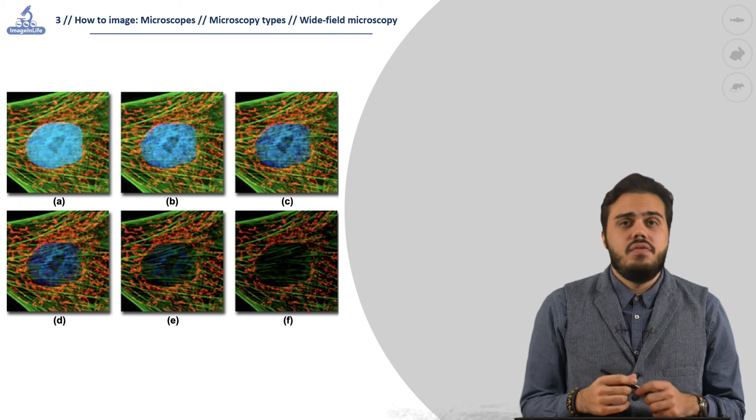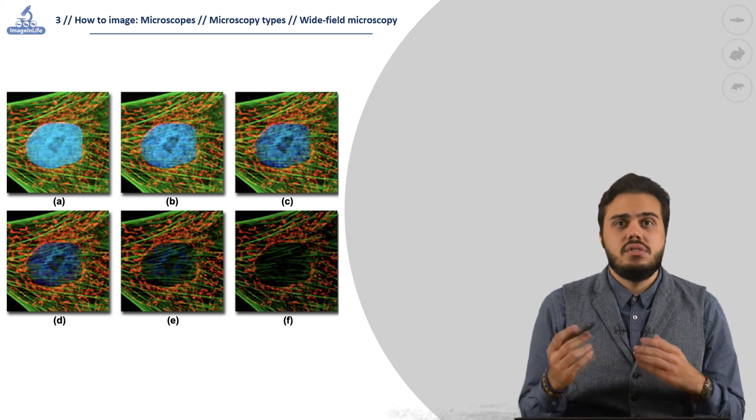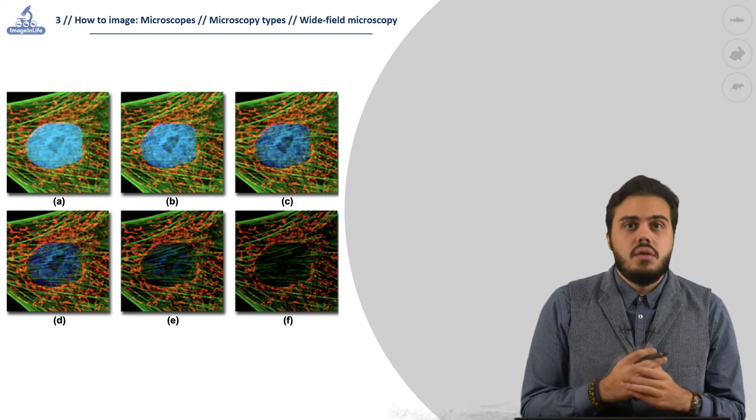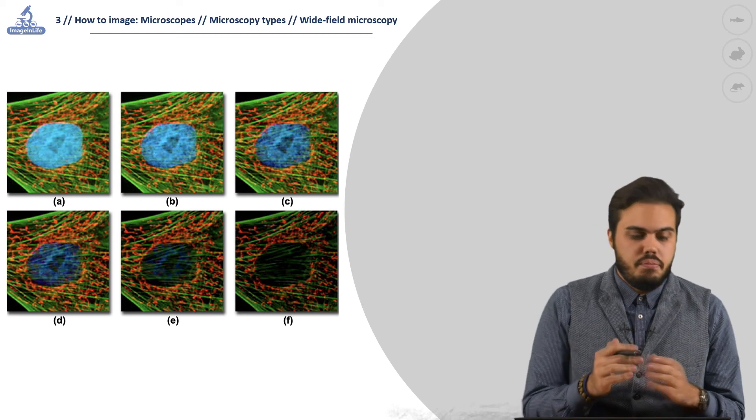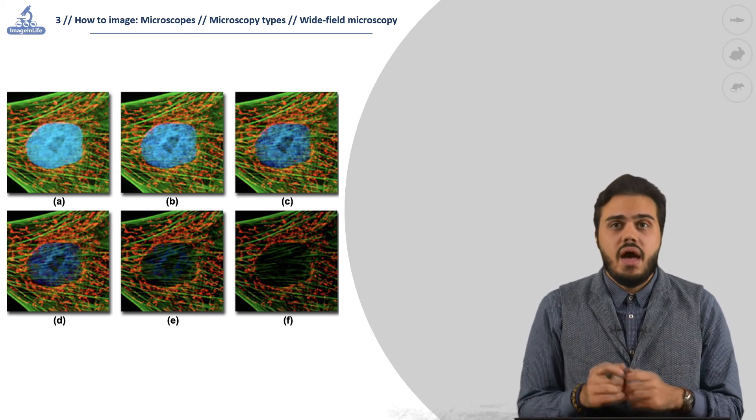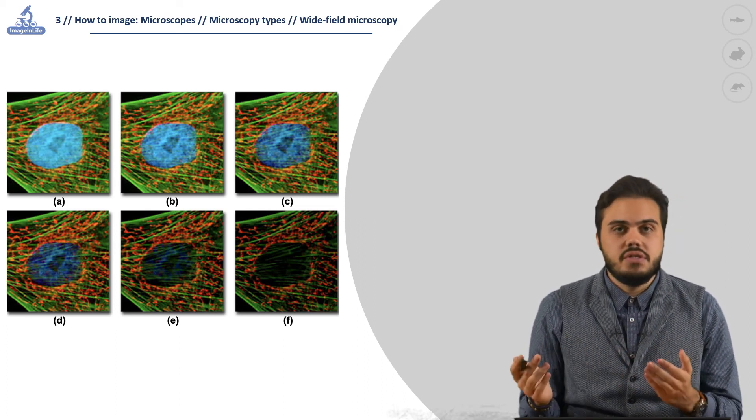After relatively long exposure to exciting wavelengths, the fluorophores start to fade. In fading, we put together both quenching—passage of energy from one molecule to the other—and photobleaching, the disruption of the fluorophore itself, which is irreversible.